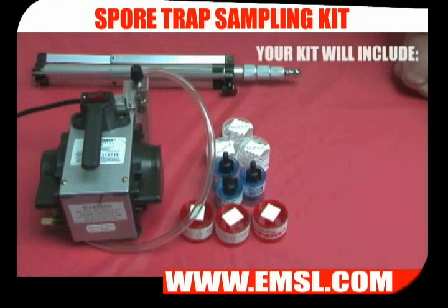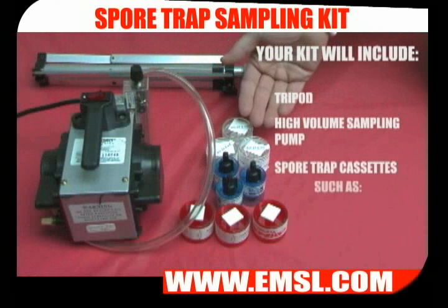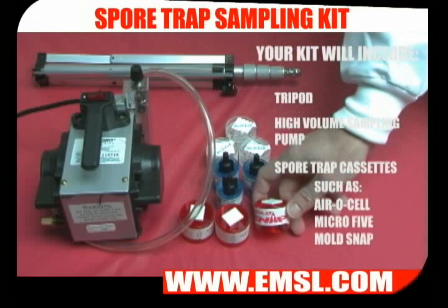In order to take a spore trap sample you will need a tripod, a high volume sampling pump, and one of the spore trap cassettes that are on the market. Here I have three for your example: an Air-O-Cell cassette, a micro 5, and a mold snap.